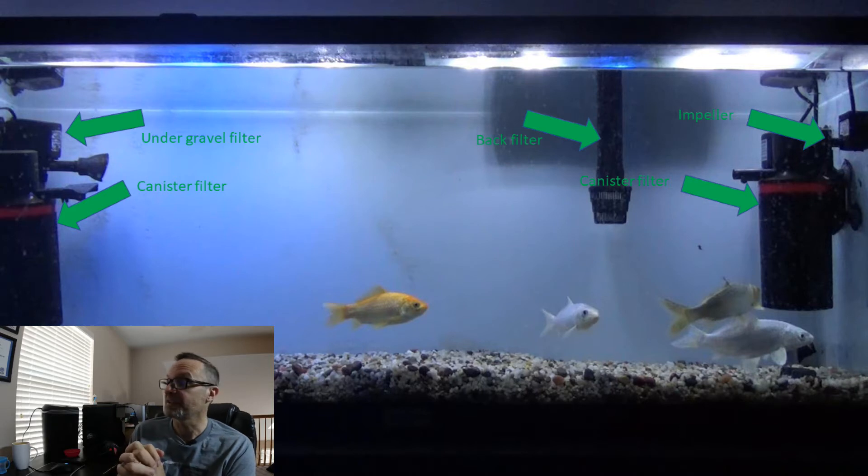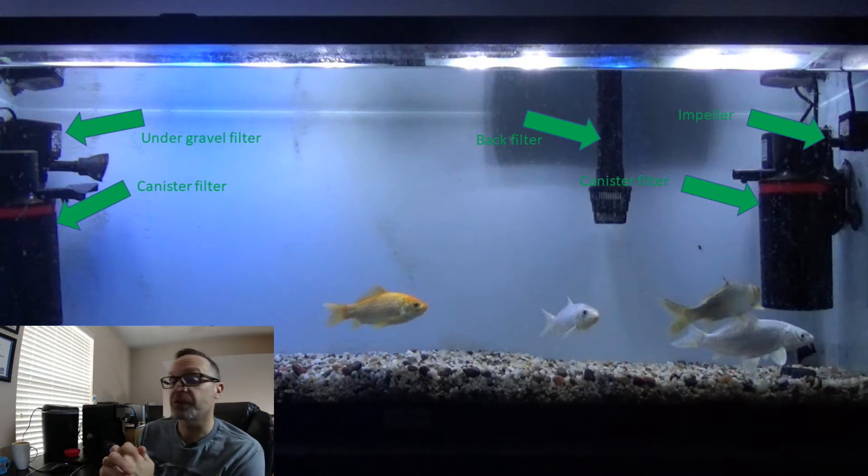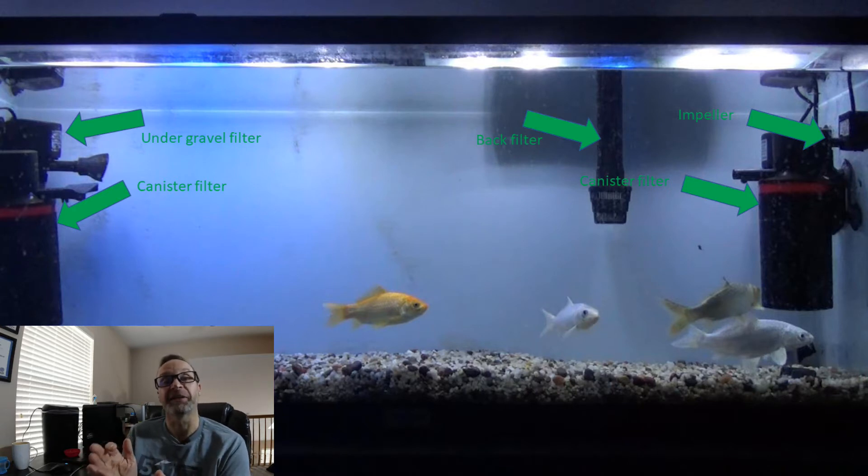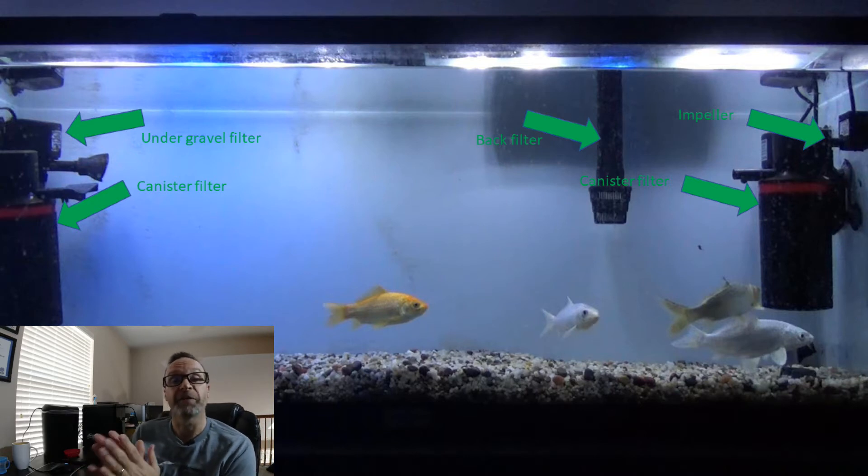Now let's look at the tank in some more detail. We have, of course, a lot of filters, because we have to remove all the amino acids after every trial. We also wait literally a week between trials in any tank so all amino acids are out of the tank. As you can see, we have a pair of large volume canister filters — the most powerful filters you can get pretty much. They have a large internal volume of carbon granules to remove amino acids.